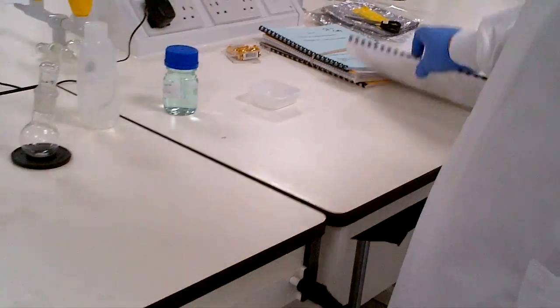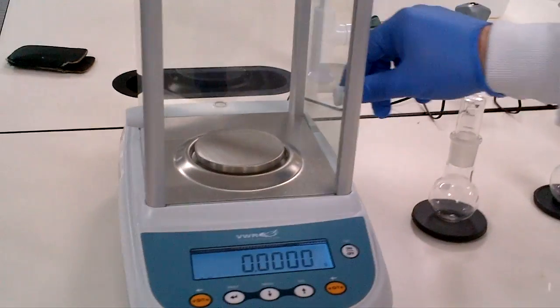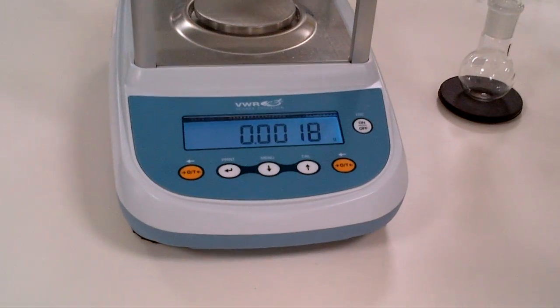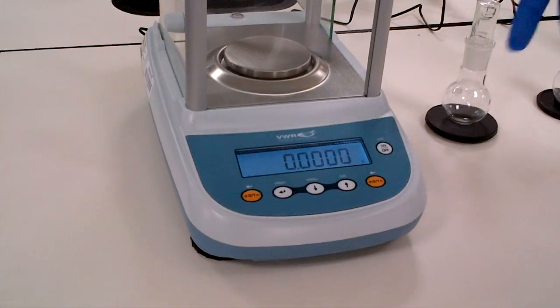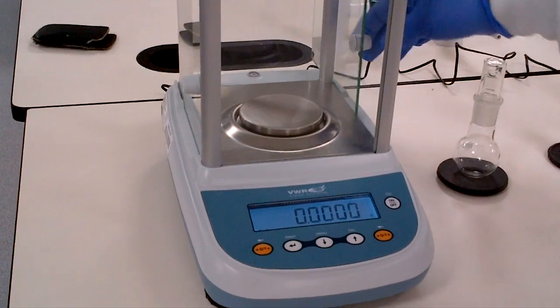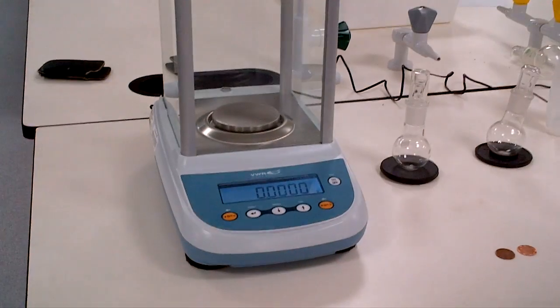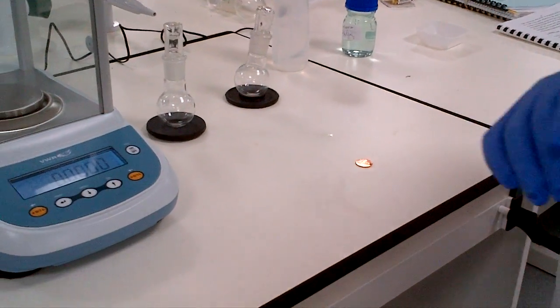When you're using an analytical balance such as this, the first thing to say is that if you open the door on the balance and you start to weigh, if someone was leaning on the bench while you're trying to measure, or talking around or stamping on the floor, you can affect the recording as it moves over the balance top. So any recordings made should be with a closed door on the balance and with as much calm and order around the bench area. It asks you to weigh out the mass of 2 coins first of all.